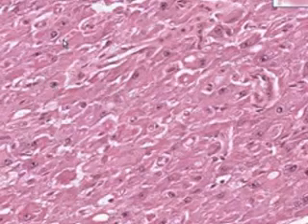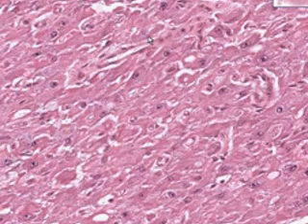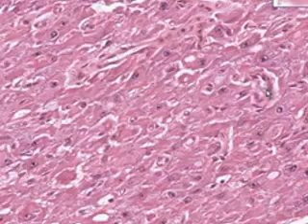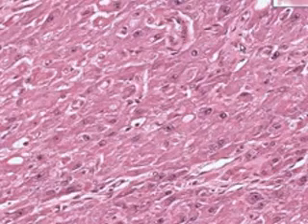And they have rather round or vesicular nuclei and a lot of granular, sometimes slightly foamy cytoplasm. And these are all luteal cells. Of course, that's not. That's a blood vessel. And that's a blood vessel, and that's a blood vessel, and that is too. But these are basically all luteal cells.